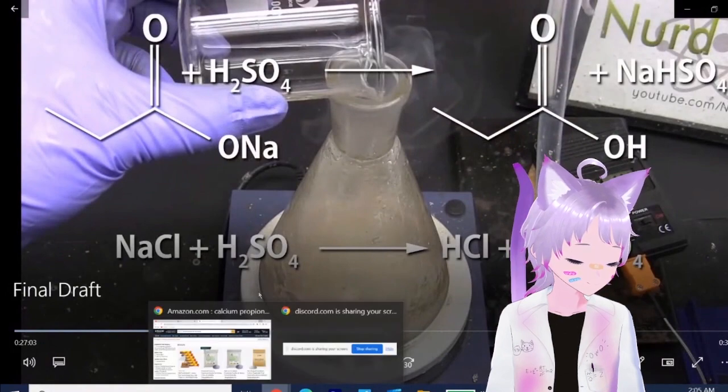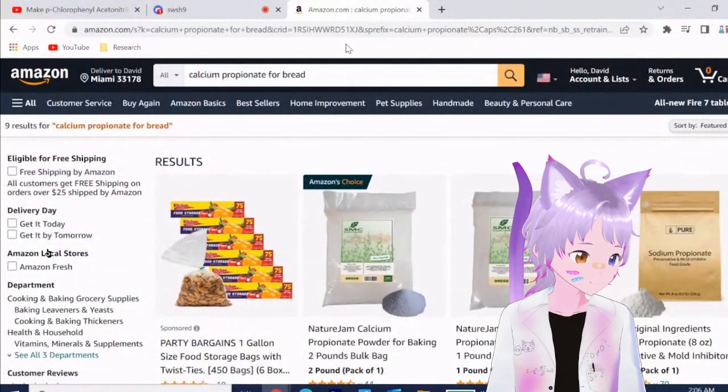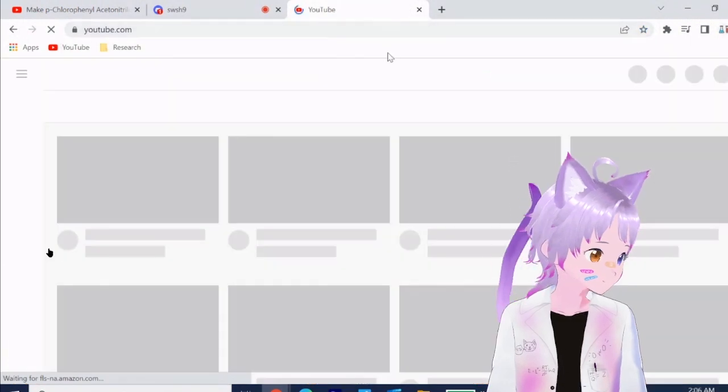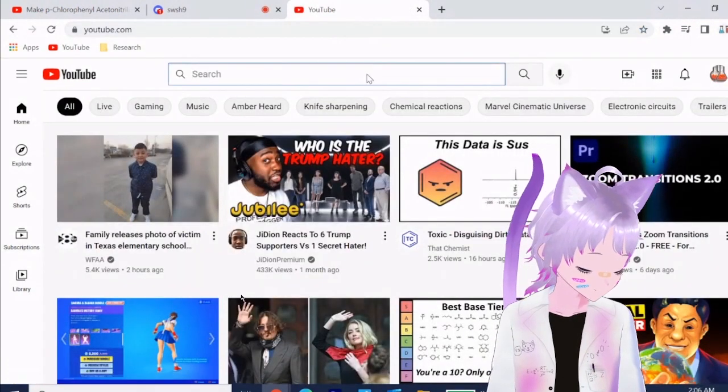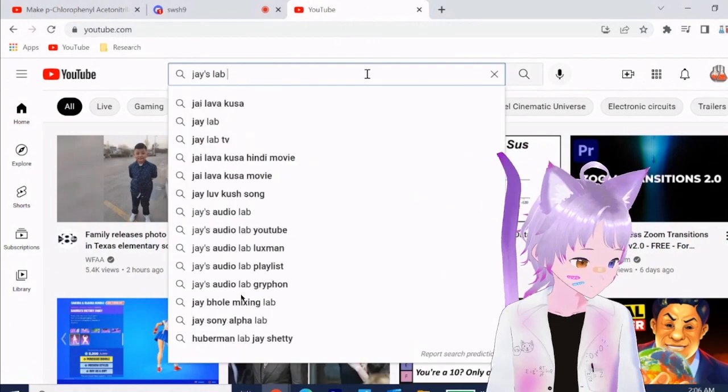Oh, for chloroform, what I think I'll do is this. Make my own bleach. And it's quite good though.